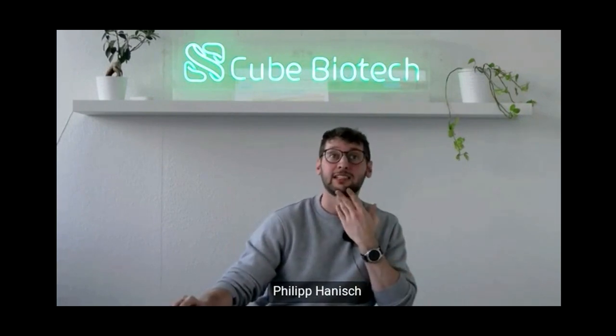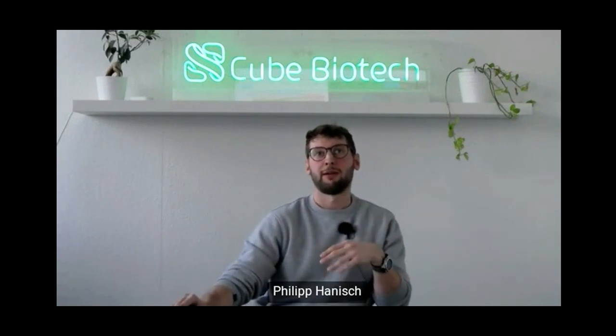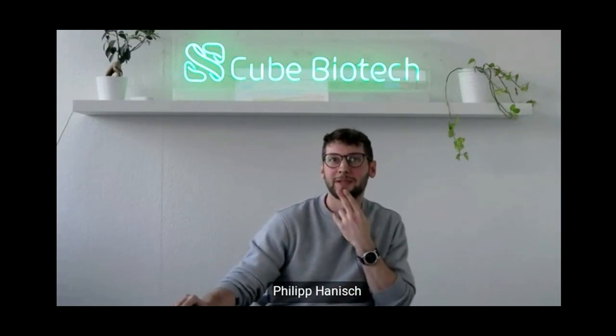And what we see is that especially for these big differences in sizes, the Monolith X works very well. Sometimes it's a bit hard to convince people that it's also valid, but we hope to work on this. Yes, let's convince them. And so I think what you mentioned also is that this type of big oligomers, small molecule binding affinity measurement is one thing that you can tackle very well with the Monolith.